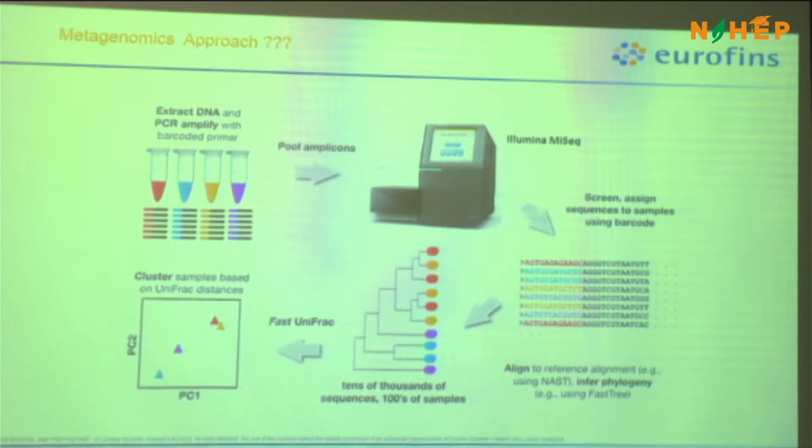Then I will start with metagenomic approaches. And I will give you a brief overview of how the entire process works, and then we'll go into the detail of the analysis. I believe you have already learned what metagenomics is. In brief, metagenomics has different techniques, and we need to know our aim, our objective, to decide which service we need to opt for.